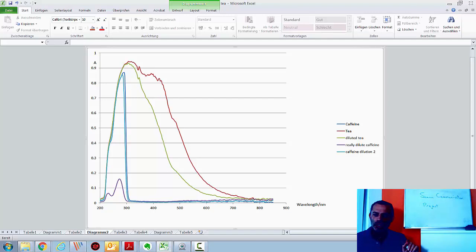And if we dilute it again we see that it shifts across or it appears to shift across, so this peak is also probably still cut off. But this edge is now coming into focus and it suggests that I will have to dilute the tea to measure it. If we dilute the caffeine, that's blue, then very little happens. So obviously I had a very high concentration of caffeine for that and it was only a couple of crystals in a milliliter. So not very much at all.